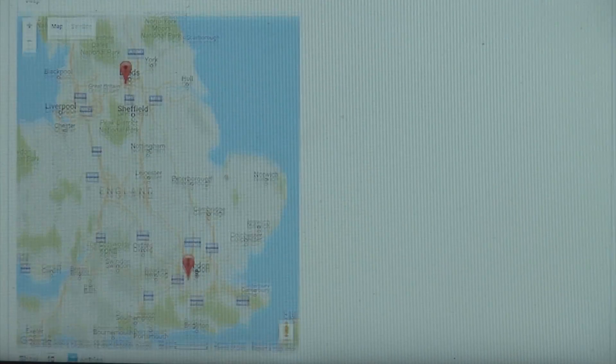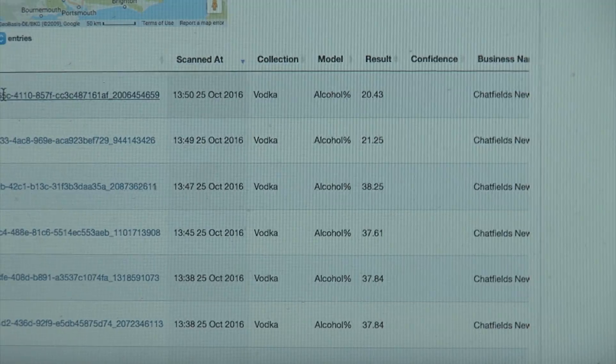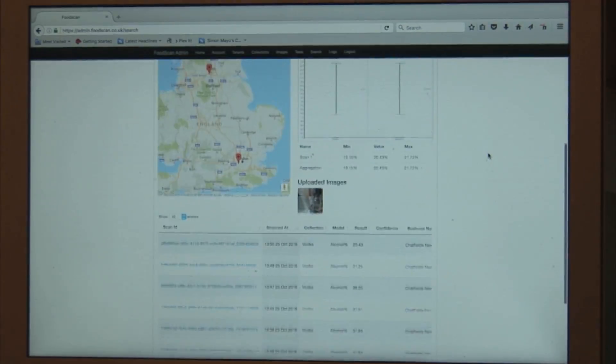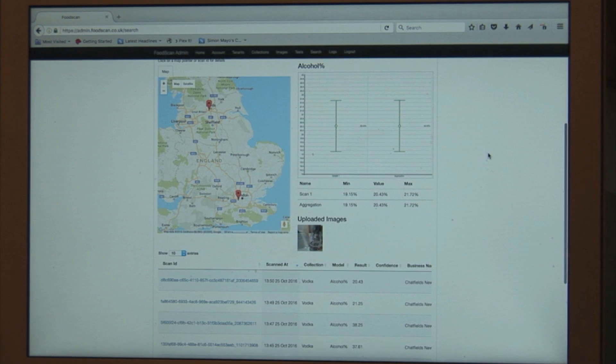The results have already been written to the cloud database. They're plotted onto a map and you can have a look at the test that we have just taken, and you can download the results for further analysis.